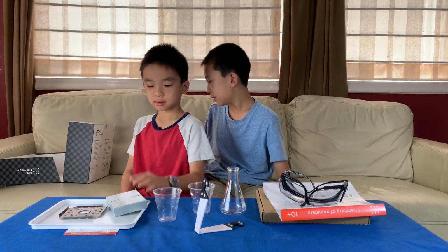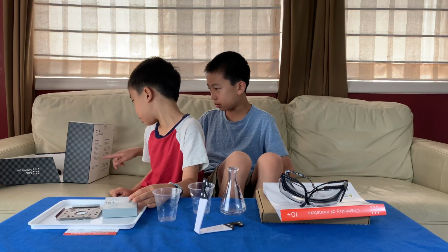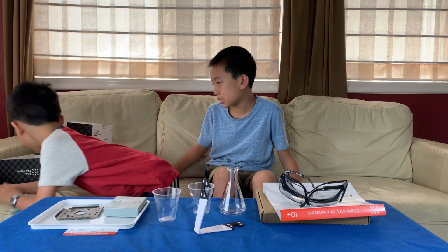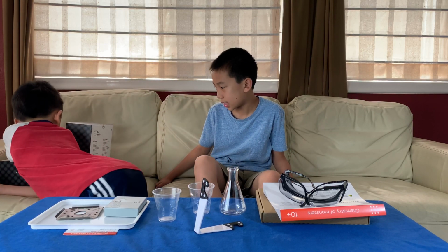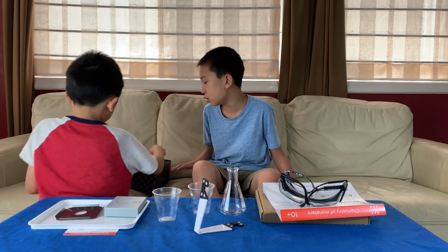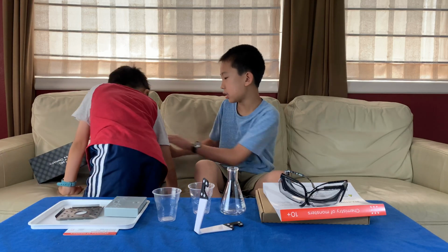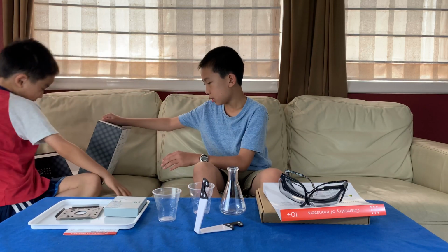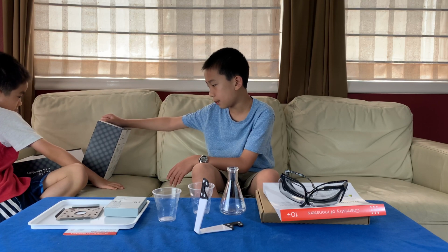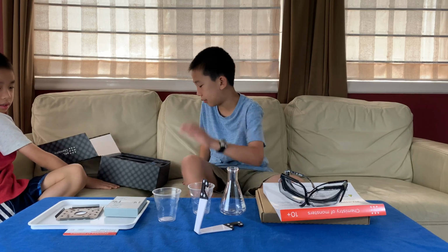Okay, so let's make sure we know what everything is. We know what the safety glasses are. We know what the plastic beaker, glass beaker, and glass flask are. There are 3 rubber stoppers, a funnel, and a small funnel. There's also a pocket stove and flame diffuser, a cork hot pot stand, and we know what everything else is.